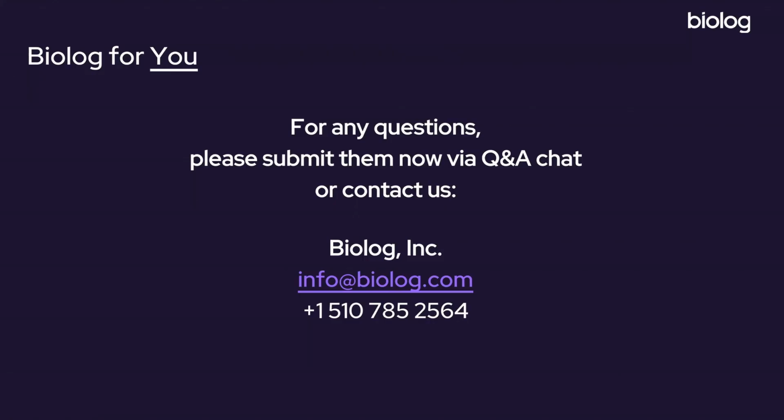Okay, so work fast. And then there's a question here. This is a real tip and trick, I think. If somebody has a really sticky bacteria, and the example they gave is a Campylobacter, do you have any tips for how to get a pure culture from something sticky like that?